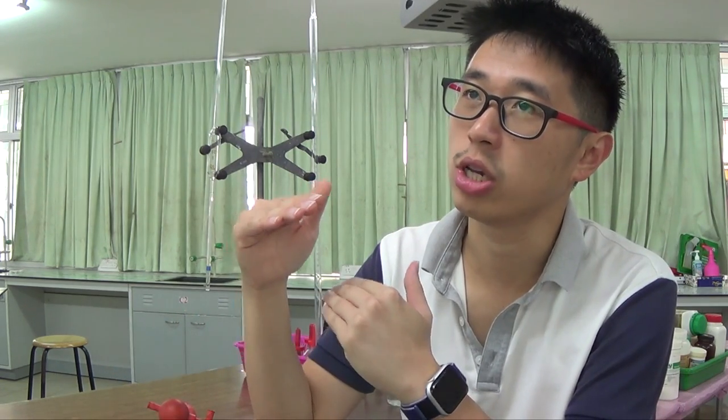In this tutorial video I'll go through the October-November 2019 paper 3-2. This is an actual practical paper, but what concerns a lot of people really is the experimental skill that I'm going to show you today. Today is actually a calorimetric experiment, so we're going to measure temperature change. Actually, we're going to calculate temperature change from the final temperature as well as initial temperature of the reaction itself, and we're going to do a little bit of calorimetry.